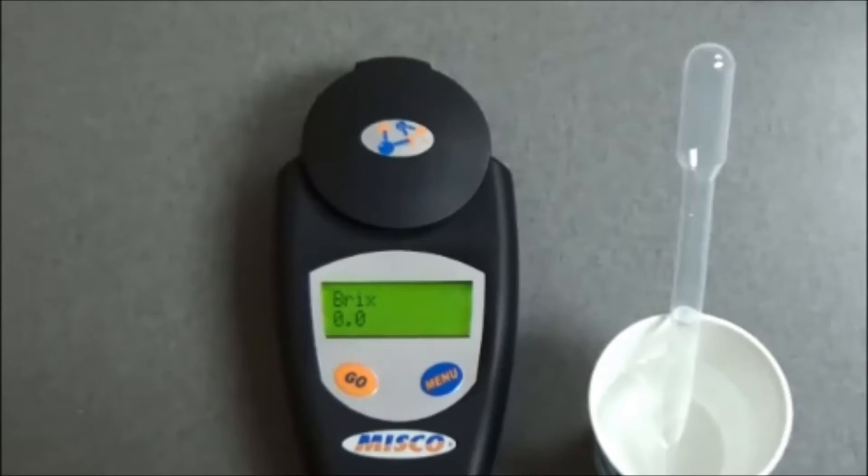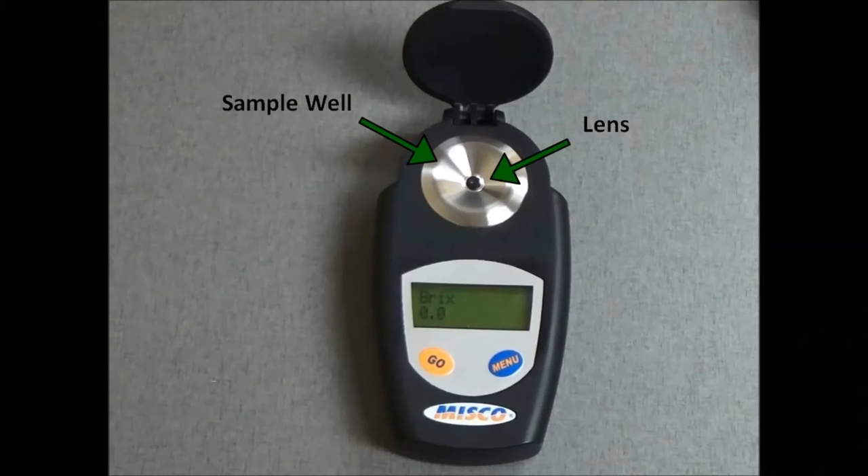If the device does not read 0.0, consult your manufacturer's operating manual. Please note, colostrum has a high fat content. If your refractometer is not properly cleaned, fat residue can build up on the well lens, falsely increasing its reading. Using rubbing alcohol to clean the well lens between samples will remove any fat buildup and ensure accurate results.